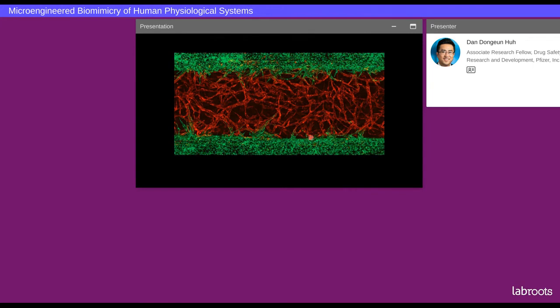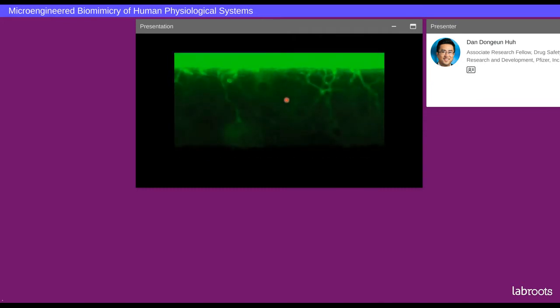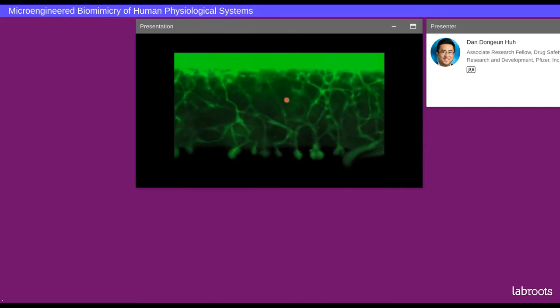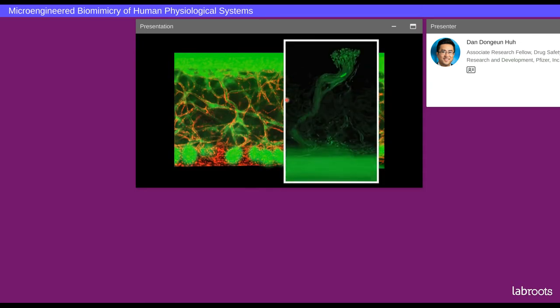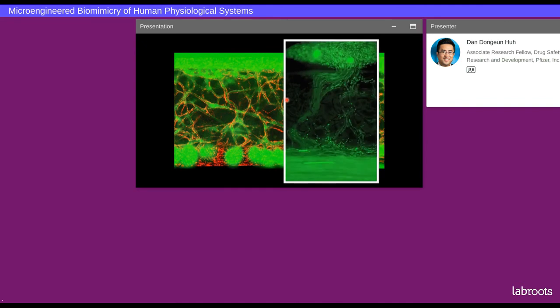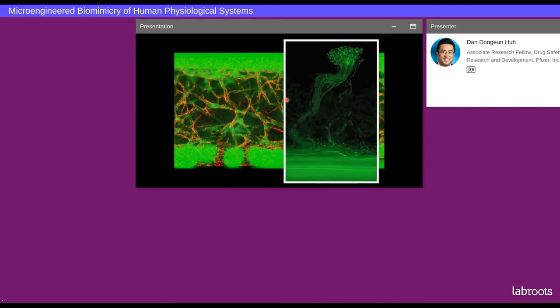This micrograph shows anastomosis of the endothelial lining in the side channels with the 3D vessels in the gel. As a result of anastomosis, the vessels open to the side channels and the whole network becomes perfusible, as you can see in this movie. This movie shows a fluorescent dye flowing through the vessels. It's also possible to flow microbeads and nanoparticles, for example, for targeted drug delivery applications.